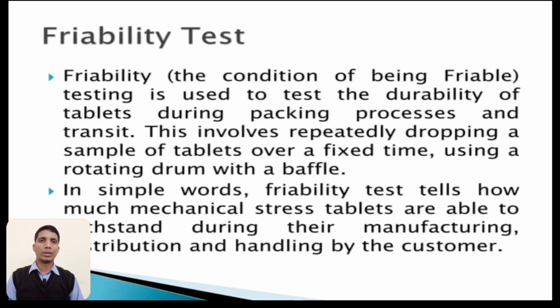Firstly, what is the friability test? It is a test named friability. It is used to test the durability and strength of the tablet during the packaging process and during the transportation of the tablets from manufacturer to consumer. This testing involves the repeated dropping of tablet samples from a fixed height and over a fixed time using a rotating drum which has a baffle.